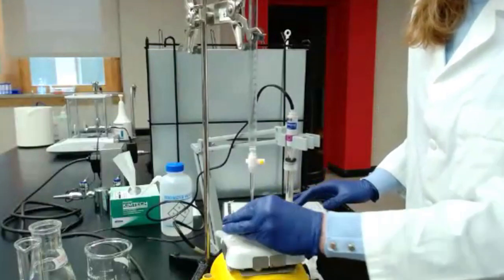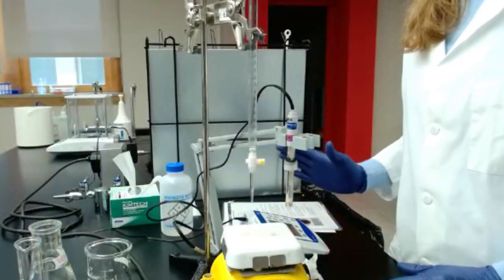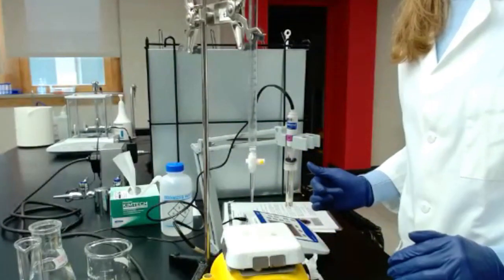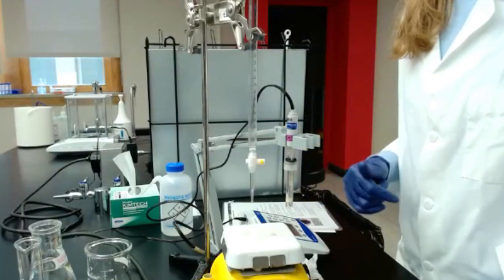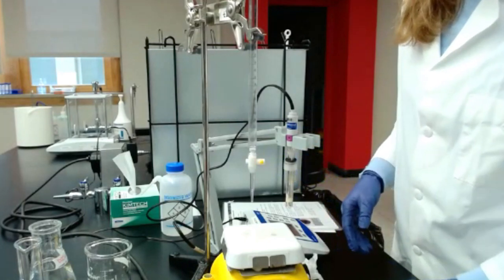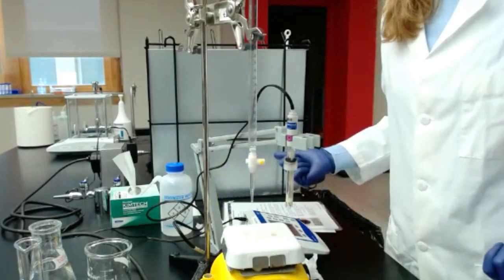That's really just to give you an indication of the calibration. If that's a correct calibration, you should be close to 100%. If that's not a good calibration, you might have less than 90%, which means you would have to redo things. Just making sure the calibration is done correctly, because that's going to really impact the final values, the final titratable acidity.